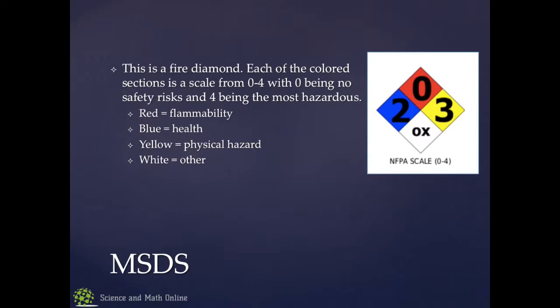Like I mentioned, I'd rather buy a bottle of 6 molar hydrochloric acid than a concentrated one that's at 12 molar. It's half the concentration. If I spill it, I've got to get it cleaned up, but it's not as dangerous in that way, and it gives me a little bit more response time, which makes me more comfortable.